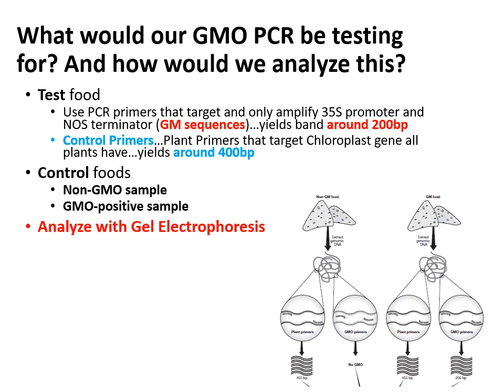Whatever food sample you want to test, we would then test to see whether or not we detect any genetic modification. You wouldn't know the exact genetic modification. You would just be able to identify whether or not this food product contains some genetically modified plant products. In order to do this, you would use PCR primers on your test food. I'm going to keep using the example of Doritos because students always love testing Doritos.